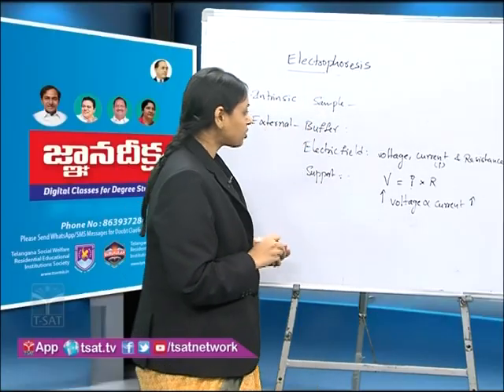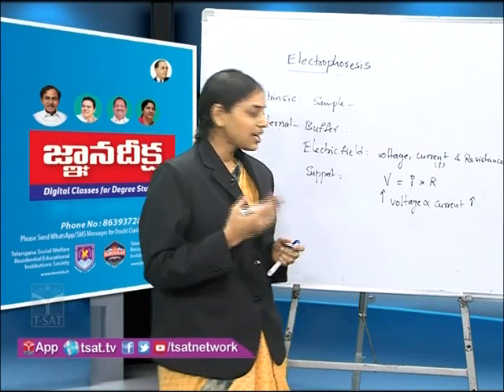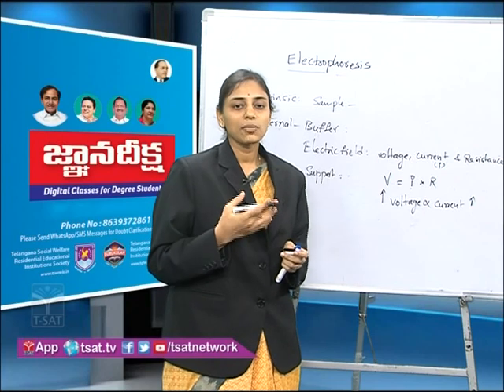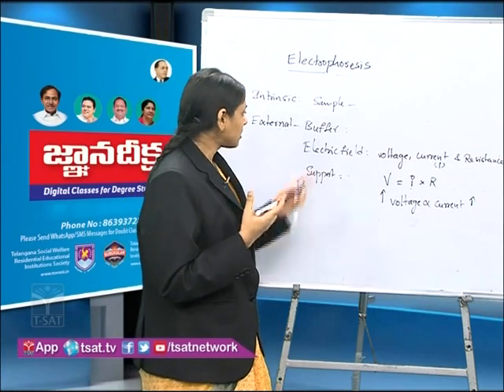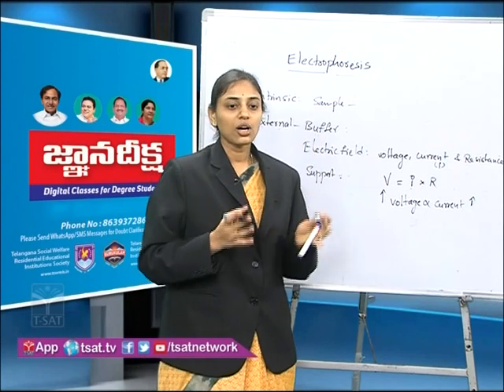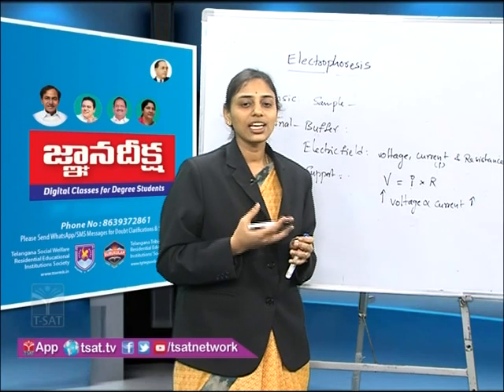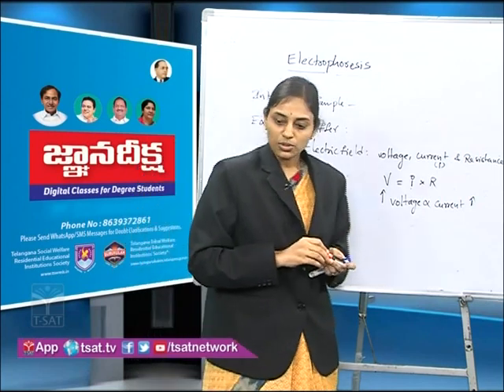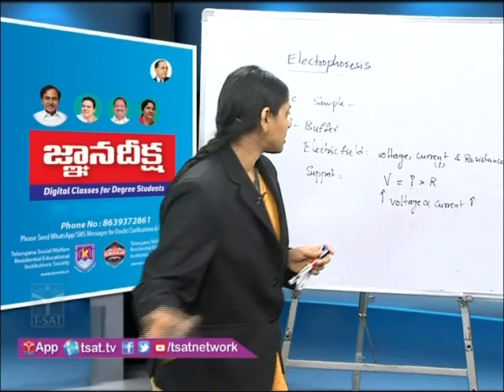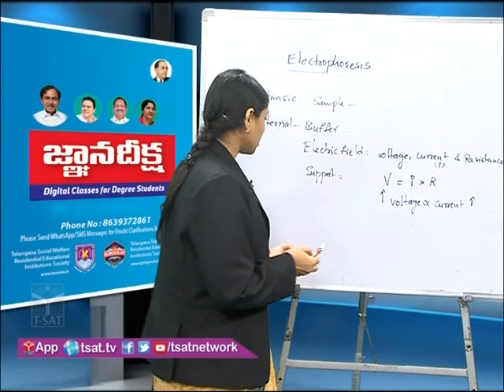But here we need to take care that if the voltage is increased, there is a chance that the excess energy might dissipate as heat and it will result in an increase of temperature of the surrounding medium. If that happens, then the increased temperature could denature the proteins or nucleic acids under separation. So we should avoid excess temperatures. And the supporting material.